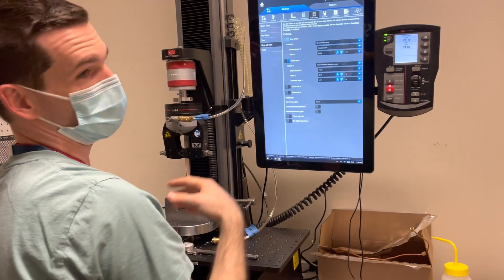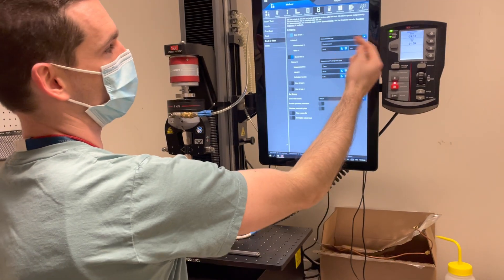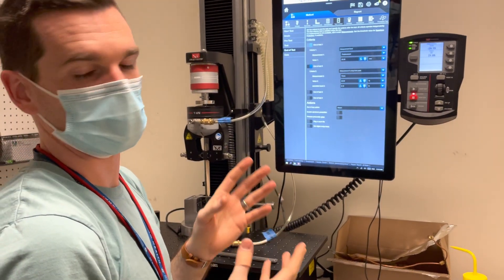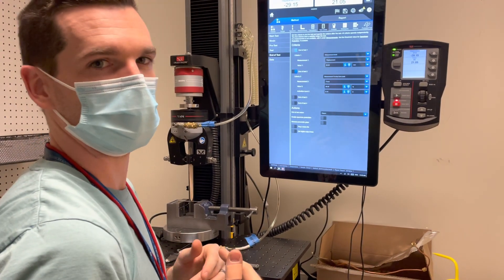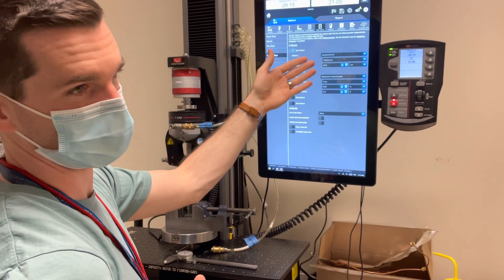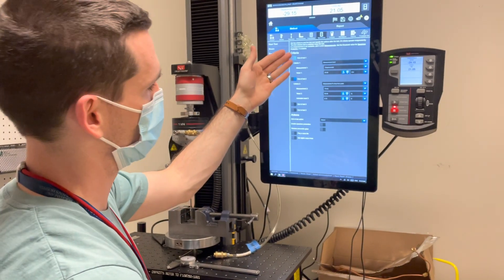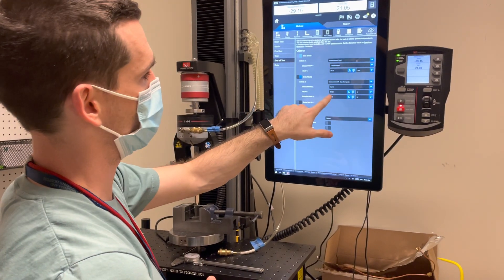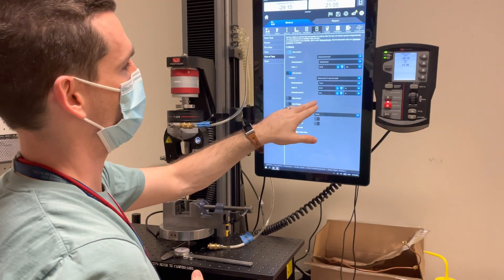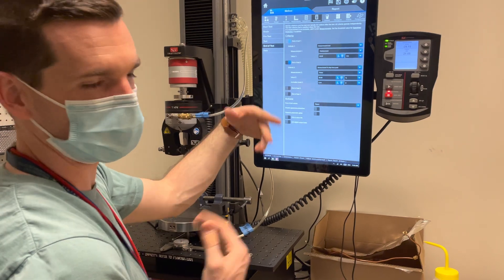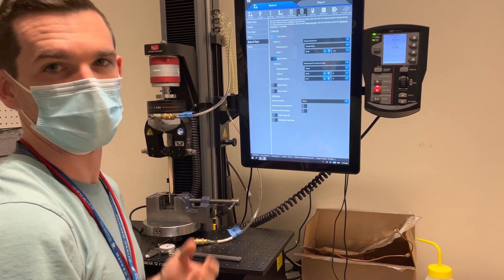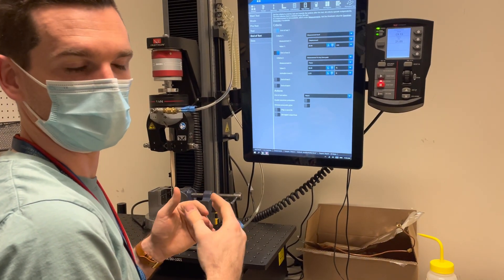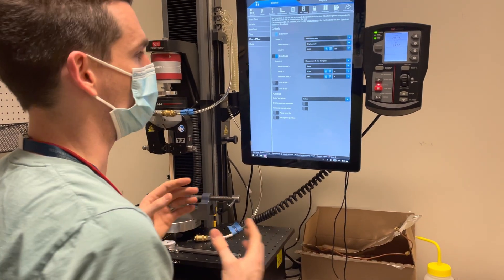At the end of the test, I define what qualifies as the end. I can choose it goes a certain distance — that's what I did here — or it goes for a set amount of time, or multiple methods. The way I've set it up: move to 25 millimeters distance and then stop. Or if the load drops 50% from a peak value after the load hits 0.1 newtons, then also stop the test. At end of test, it returns to the original position, which helps get the same starting position for all tests and makes things more consistent.